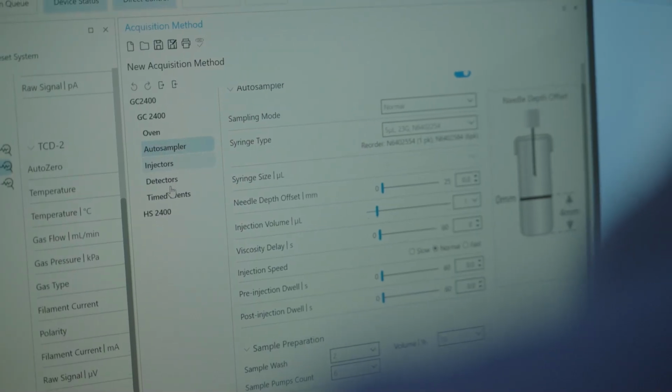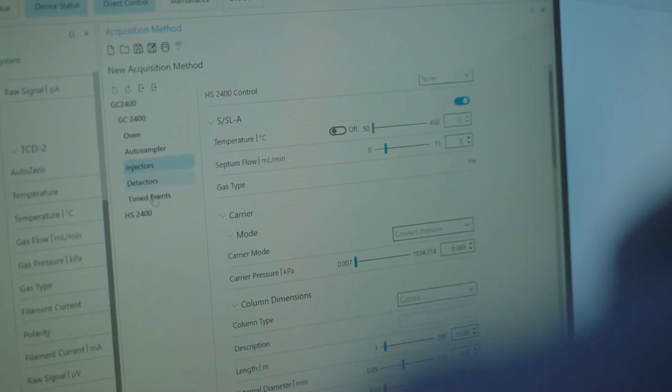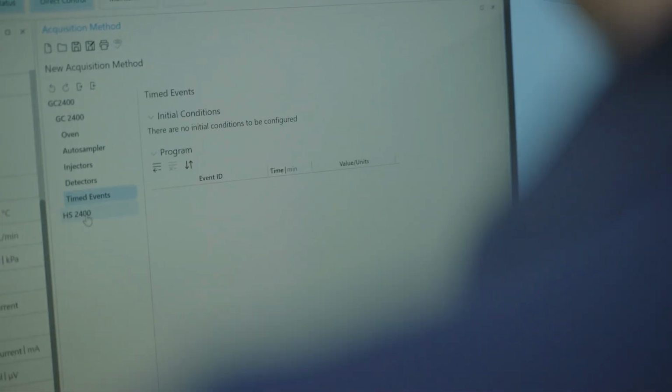And search tool, so all the data, all the information that is acquired and produced in the chromatography lab is stored in the database of the chromatography data system, and as such, we can take advantage of the search tools that the chromatography data system has.